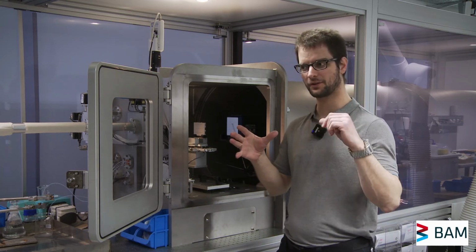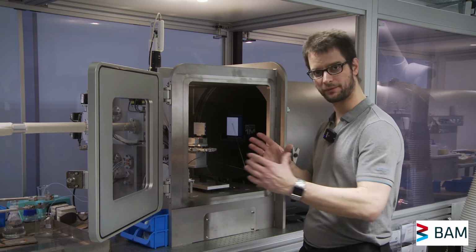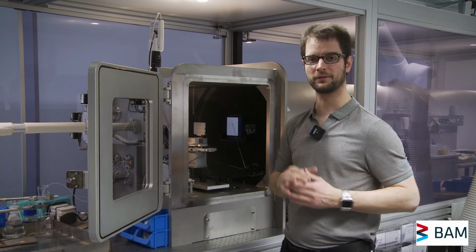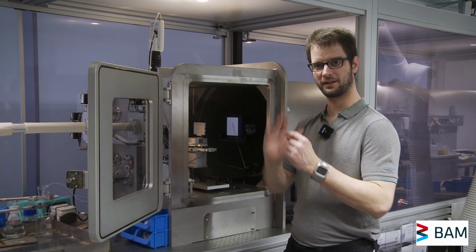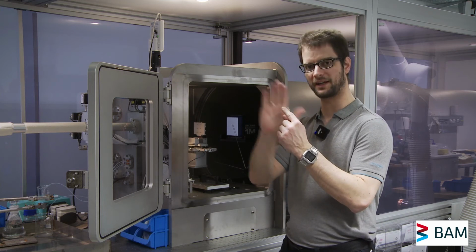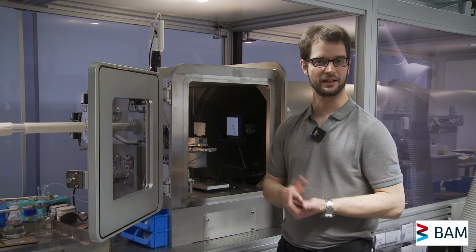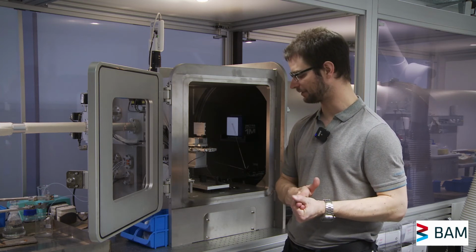The detector sits on a 3-axis motorized stage, so we can move it backwards and forwards. You can move it close to the sample when you want a wide field of view, and you can move it far away from the sample when you want to focus on the small scattering angles. But we can also move it sideways. So in particular, when you're close to the sample, if you want to get even wider angles, you can move the detector sideways to focus on particular diffraction rings, and get a nice extension to your scattering angle range.